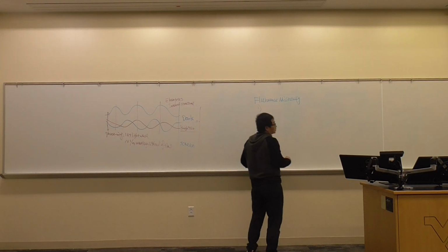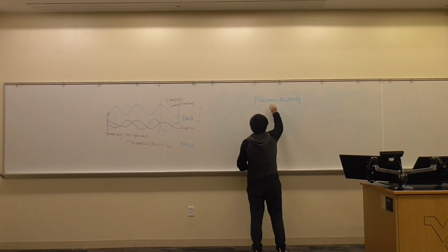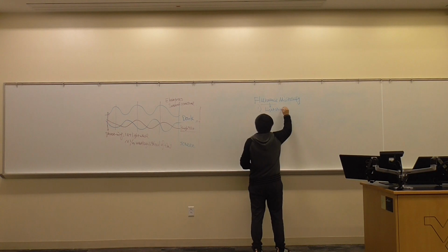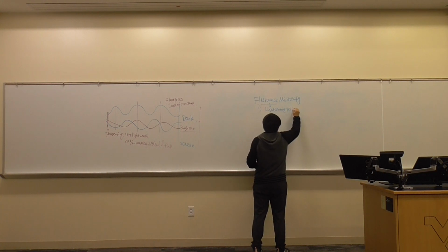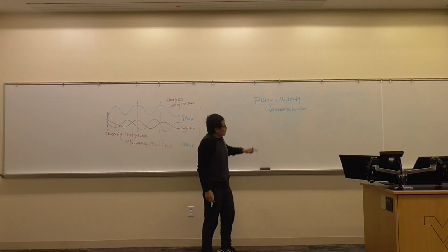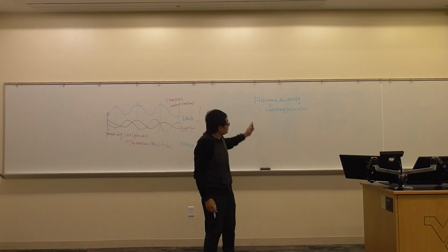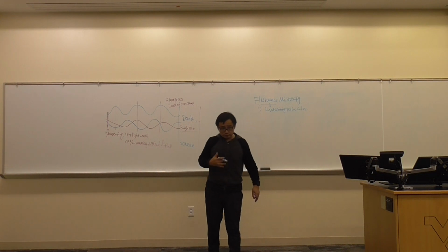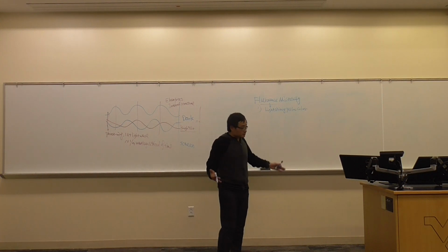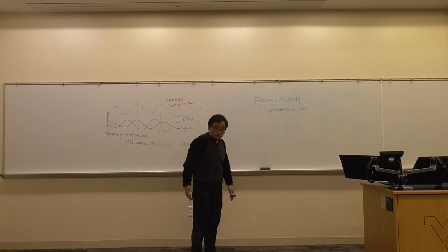First of all, you should know what fluorescence is. This is light shining a yellow color. Now, I don't know how much you know about diamonds. Diamonds should not have too much fluorescence. If you have too much fluorescence, it means the purity is lower. But in microbiology and microscopy, we like fluorescence.